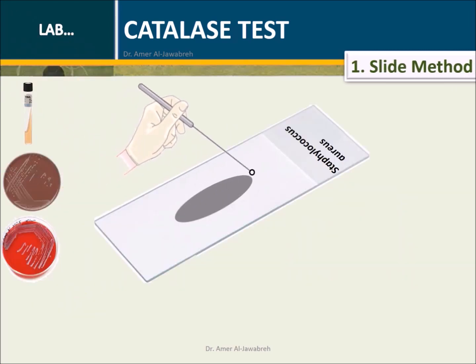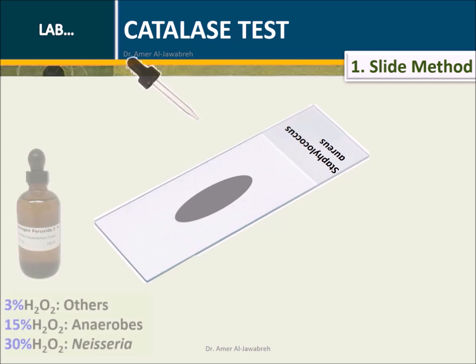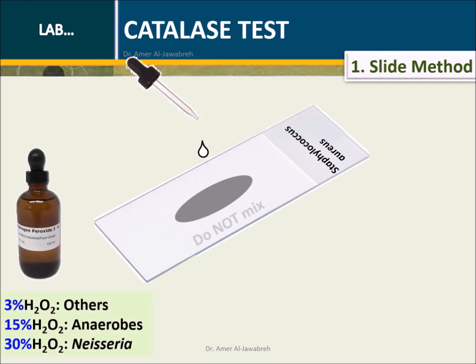Slide method: On a labeled slide and using a sterile loop, pick a few colonies from the culture plate or tube and transfer onto the slide. Add one drop of three percent hydrogen peroxide on the sample. Do not mix.